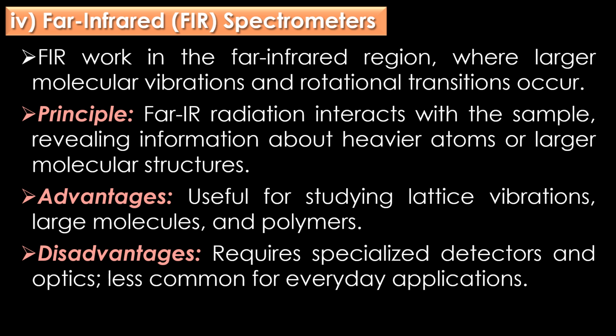Advantages: FIR spectrometers are useful for studying lattice vibrations, large molecules, and polymers. Disadvantages: FIR spectrometers require specialized detectors and optics and are less common for everyday applications.